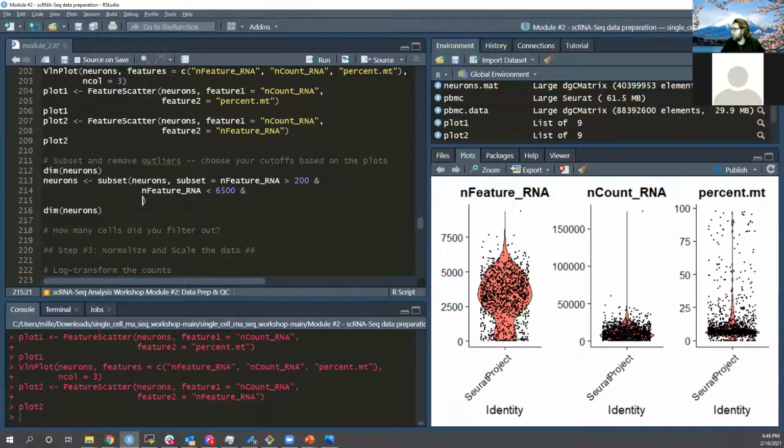So now let's go back to our mitochondrial, and we're going to set percent MT less than 15. So that might have been too conservative. If you don't want to risk losing your initial data and you think you want to relax these later, just start with something that's a little bit more relaxed. And then you can always bump up the stringency.